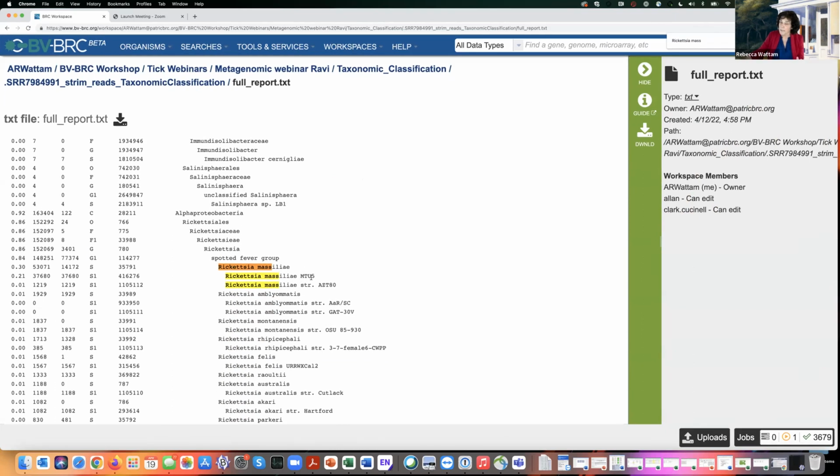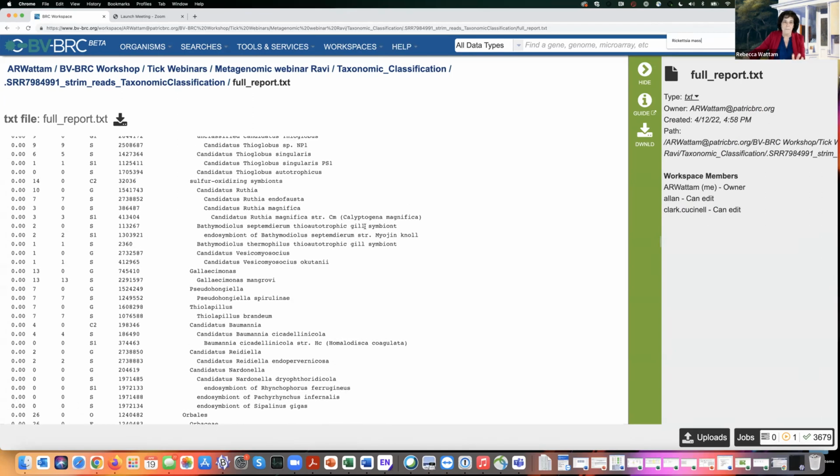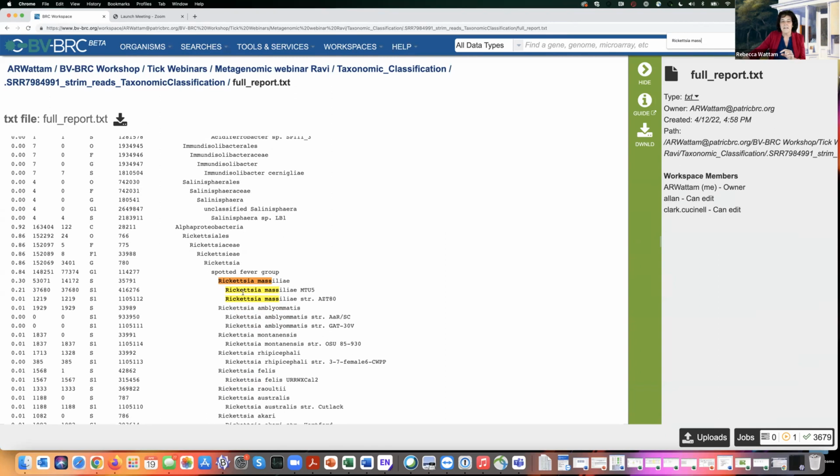So the question we're going to be asking in the rest of this webinar is, how many reads does it take for you to even be able to pull a genome out of this? This is the end of the taxonomic classification stuff. But what I did originally, and the reason I bring this up, is it gives me things I can align my reads to, to try to game the system and be able to get better results.